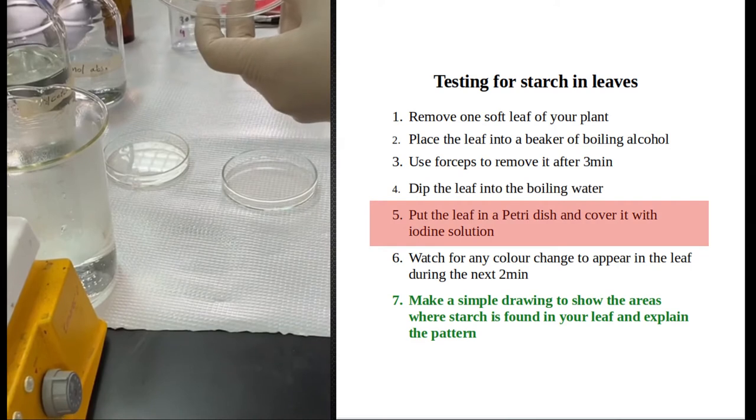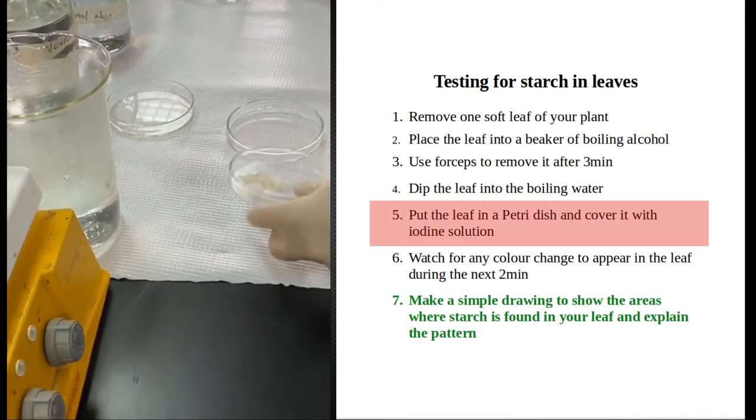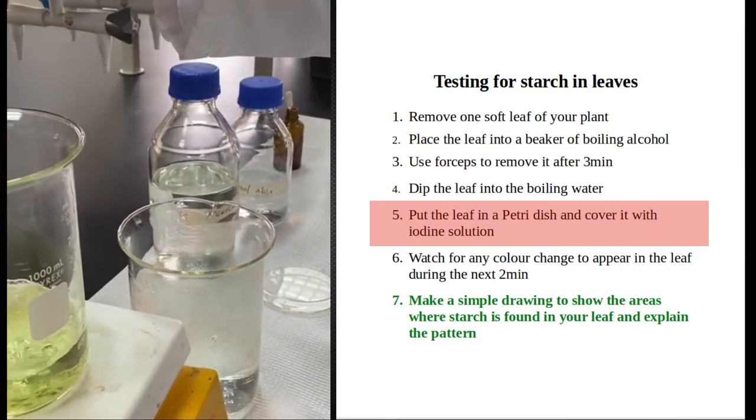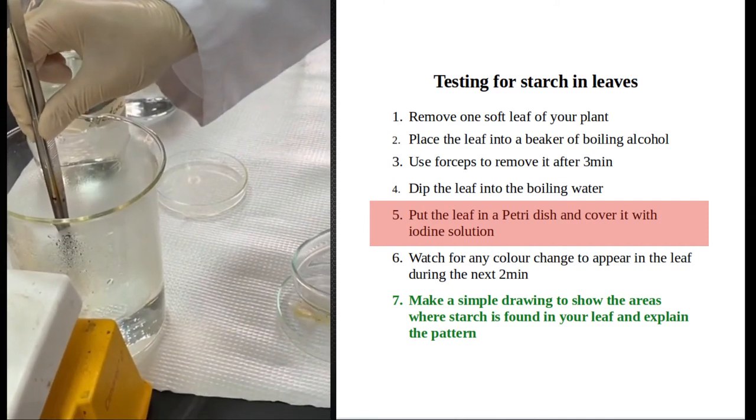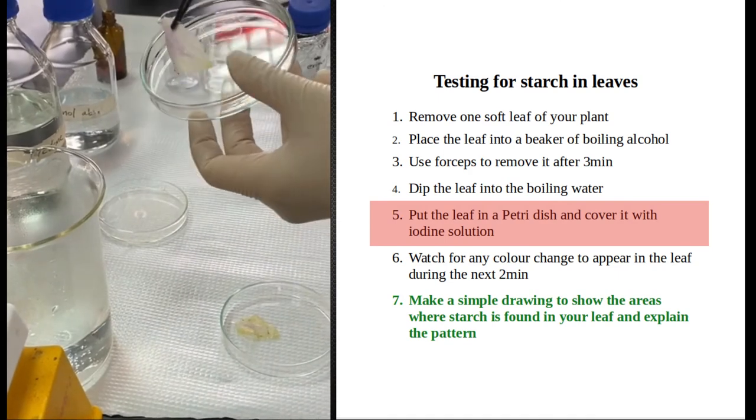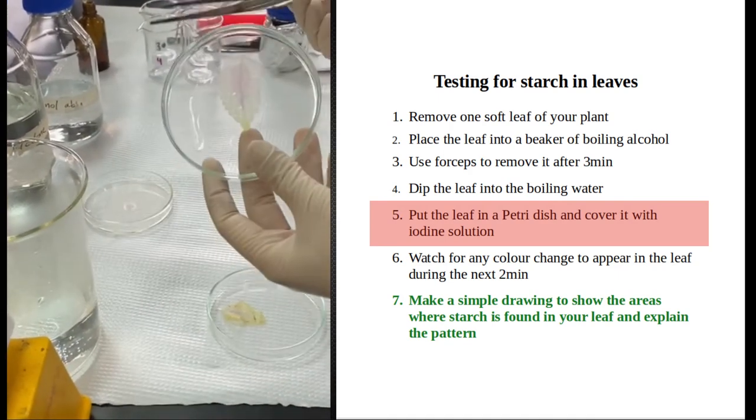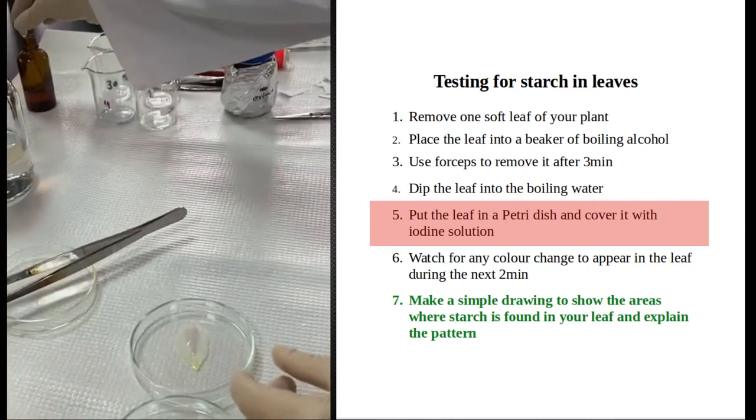This is leaf number one and this is the second leaf. As you can see, the leaf has lost its pigmentation - it's white now. The green chlorophyll is totally gone and even the purple. I will cover it with iodine to see what's going to happen.